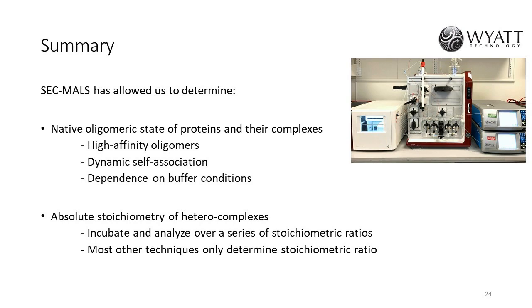However, in solution experiments like SEC-MALS, we use full-length proteins, and we observe some discrepancies and interesting results with a wild-type protein which naturally has the tail. So yes, the stoichiometries we find through SEC-MALS would be great for setting up our protein complexes at the right stoichiometry for setting up crystal trays for crystallization.